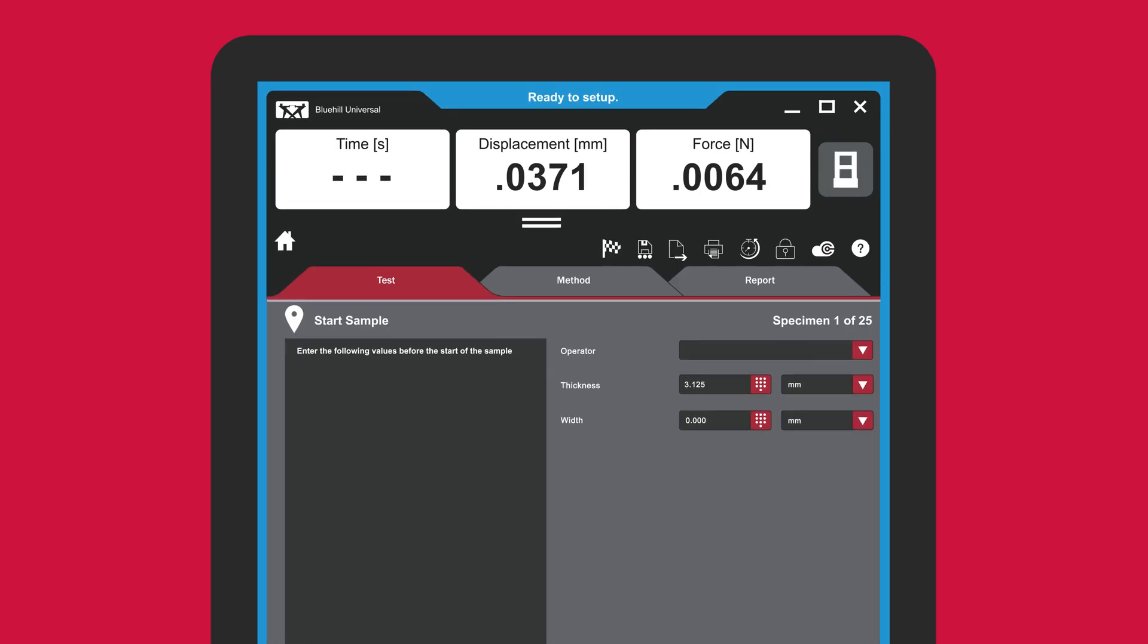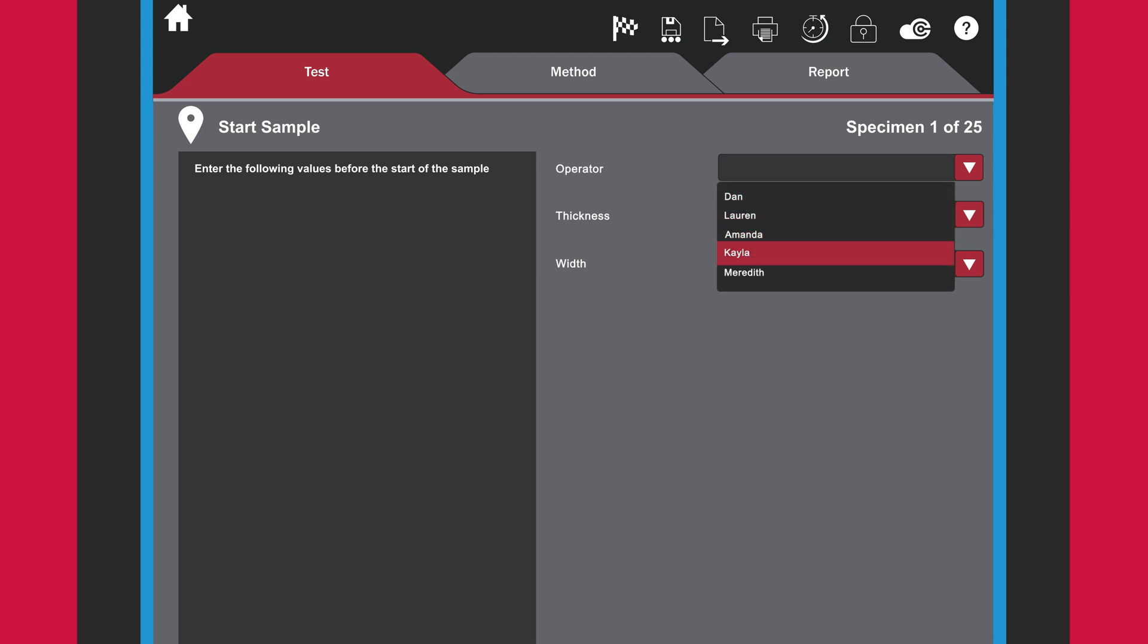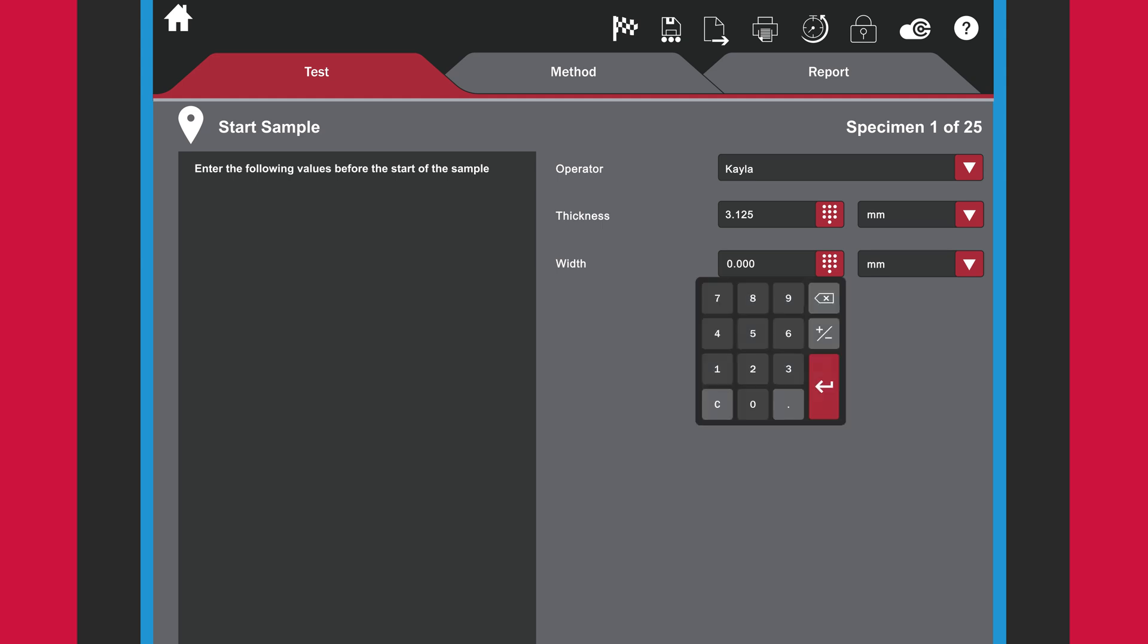Workflows can be set up to guide a user from start to finish. Prompts instruct the user to enter pre-test information such as the operator name or specimen dimensions. Drop-down menus and on-screen keypads increase efficiency and minimize errors due to manual data entry.